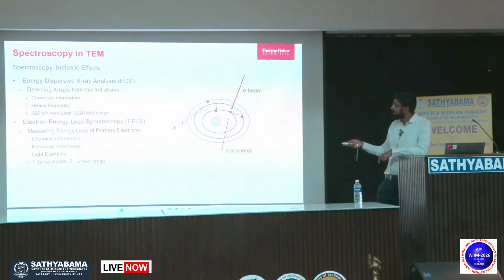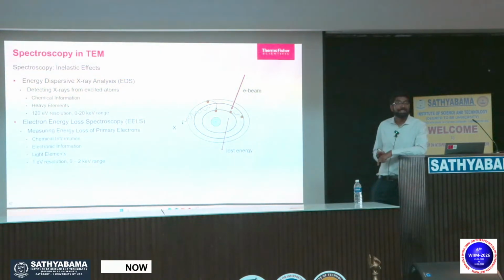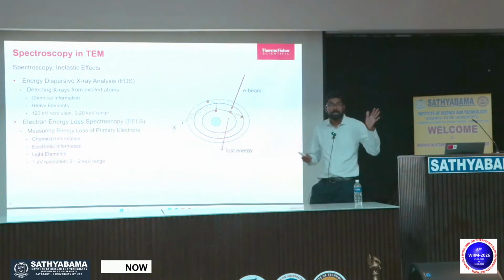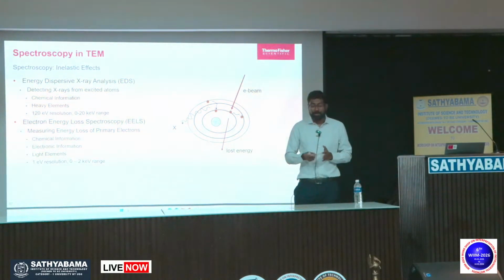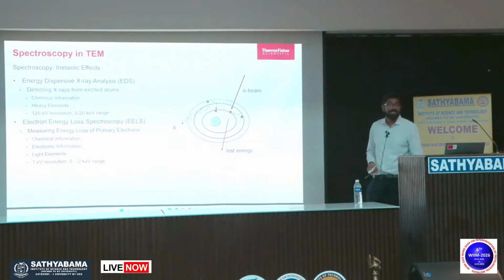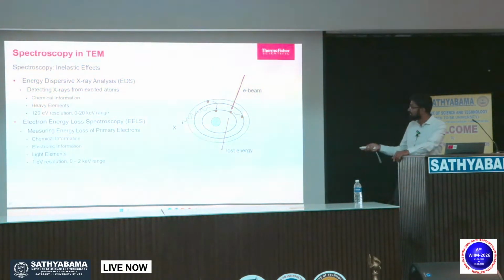Or XEDS, X-ray energy dispersive spectroscopy. Okay, XEDS. I don't know how many of you know the Barry Carter books on microscopy, the big books for material science. He always used XEDS, X-ray energy dispersive spectroscopy.